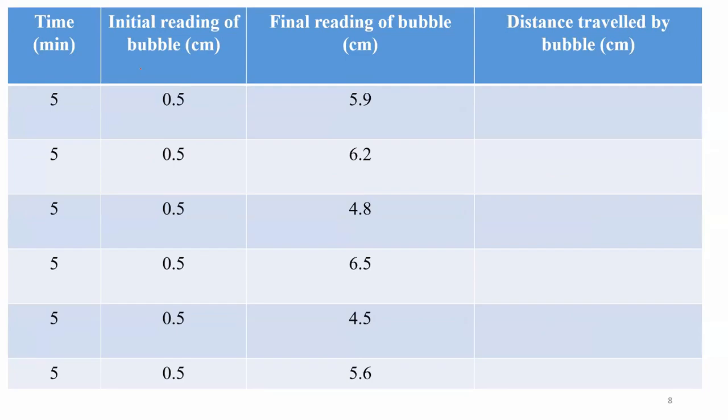The final reading 5.9 minus initial reading 0.5 equals 5.4 centimeter. In 5 minutes, the air bubbles move 5.4 centimeter.